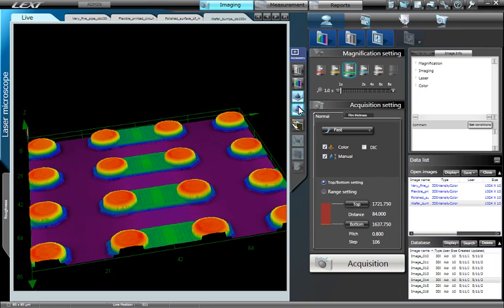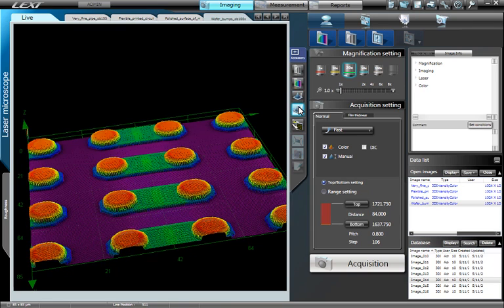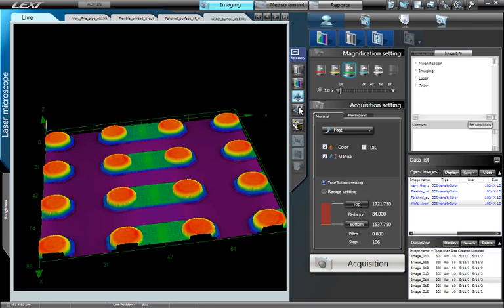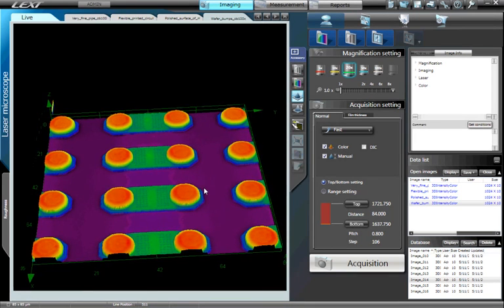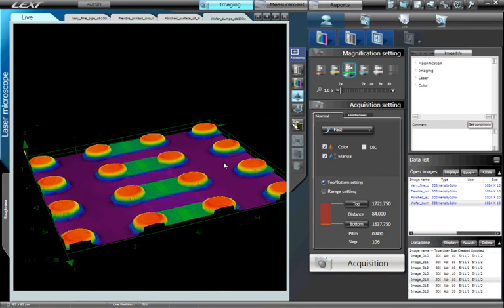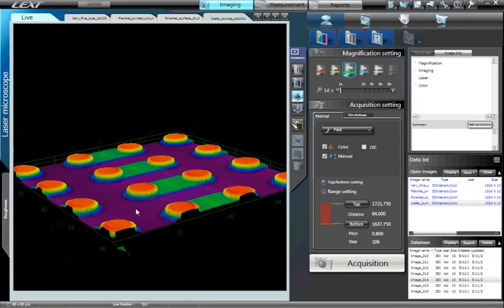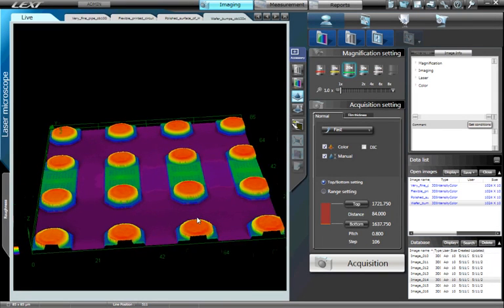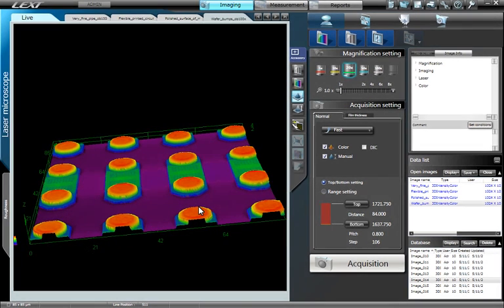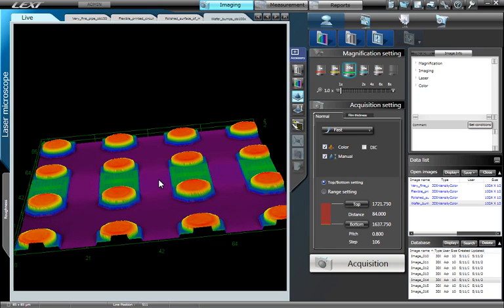To pan the 3D image, hold the left mouse button and move the mouse. Use the mouse scroll wheel to zoom in and out on the 3D image.